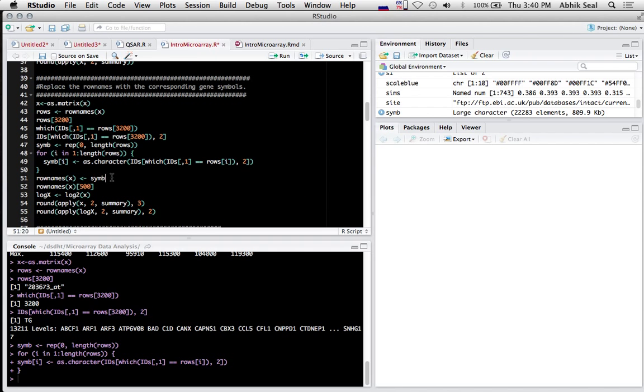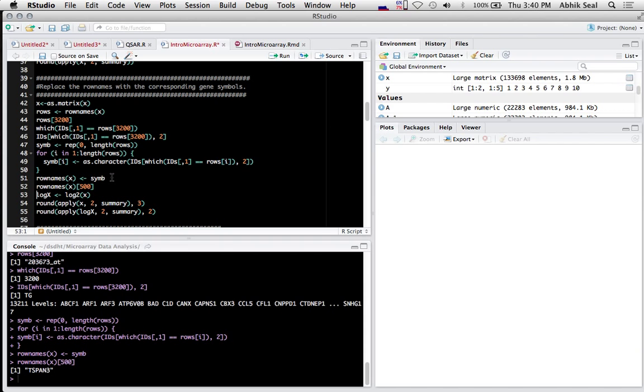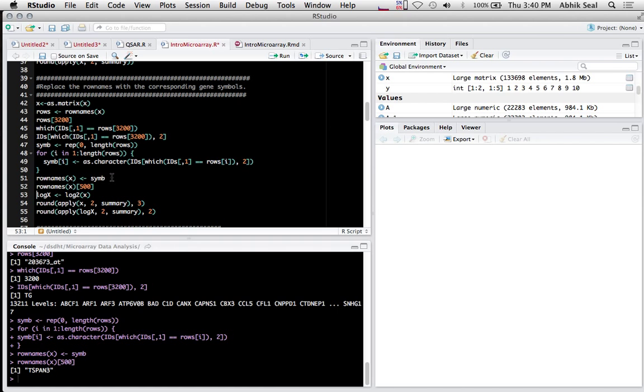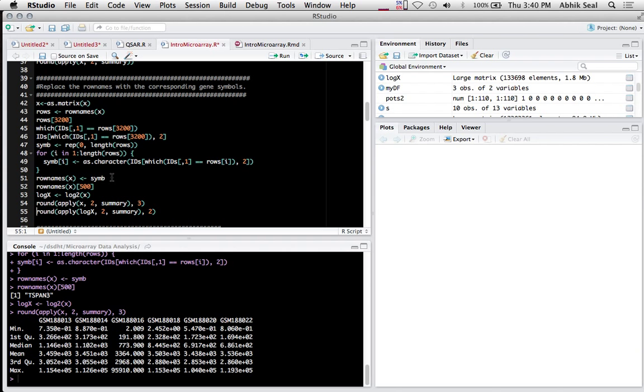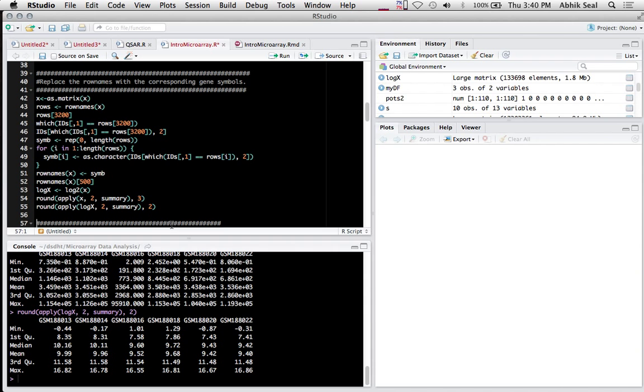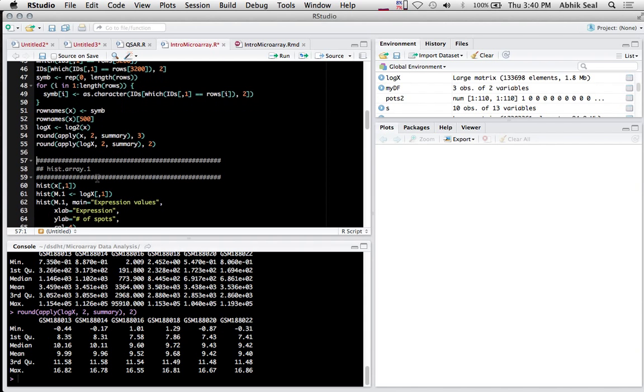Since the data has large values, I need to convert into logarithmic form. I use log base 2 to convert. You can see the summary statistics - this is the original data and this is the log-converted data.